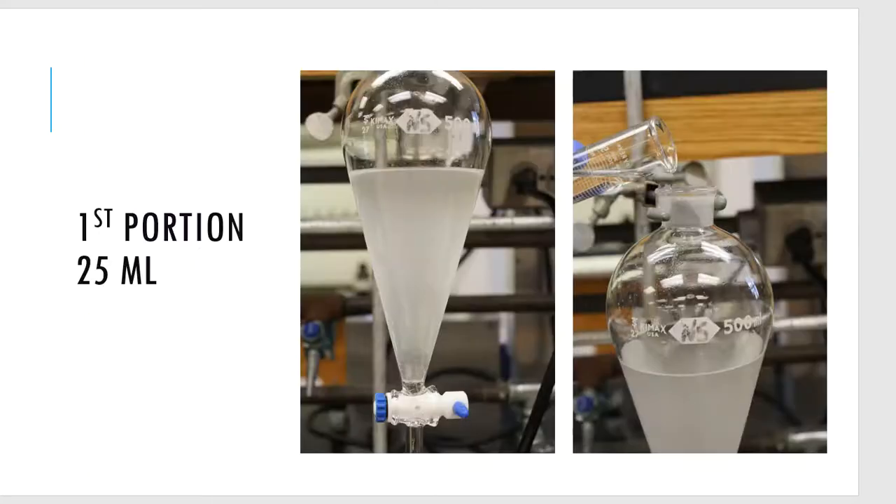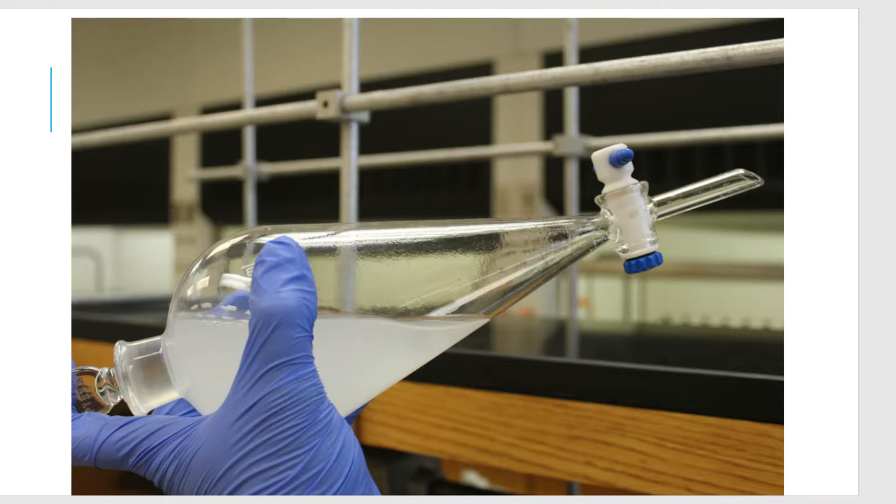I took a graduated cylinder and filled it to the 45 ml mark — that's what I'll use to wash the separatory funnel twice. About 25 mls goes into the separatory funnel first. I take these two layers and mix them properly by turning the separatory funnel on its top — with my finger on the plug, because if not, it'll pop out and all my stuff gets dumped. I give it a good shake, then open the stopcock to vent, and close it back.